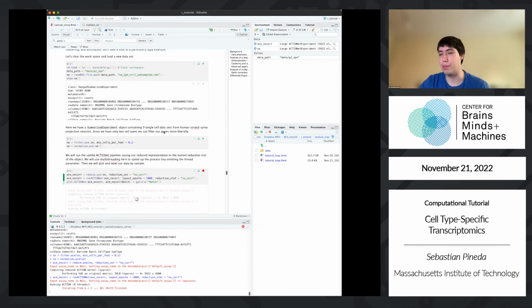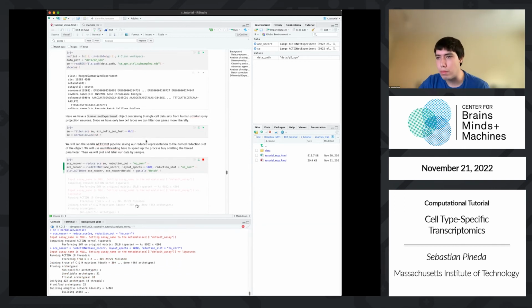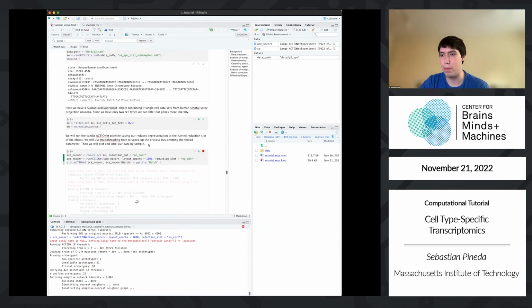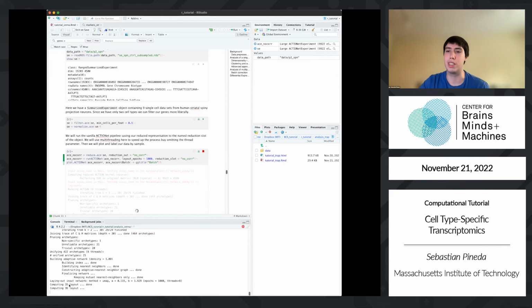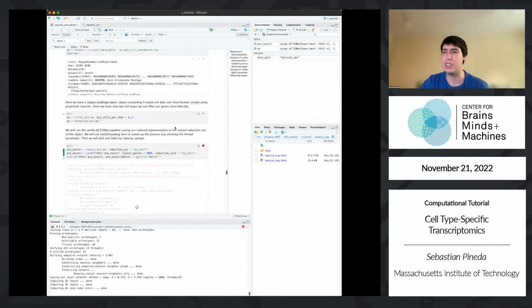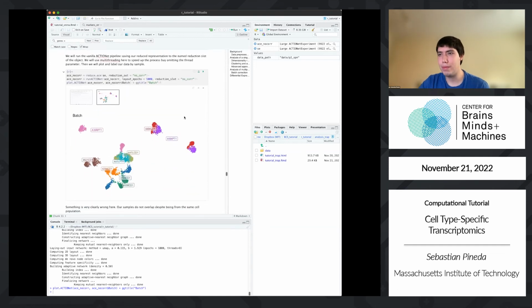So here I just subsampled, what is this, 4,500 cells, I think, from, I don't even remember how many people. Okay, it's running the algorithm, it's building the network, now it's feeding the network to the UMAP algorithm, it's giving us our 2D and 3D visualizations. I think I showed you the 3D visualizations. Okay, so each one of these colorings, each label is a different person.